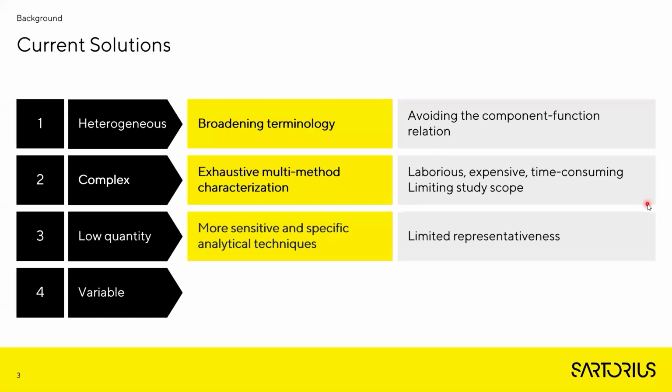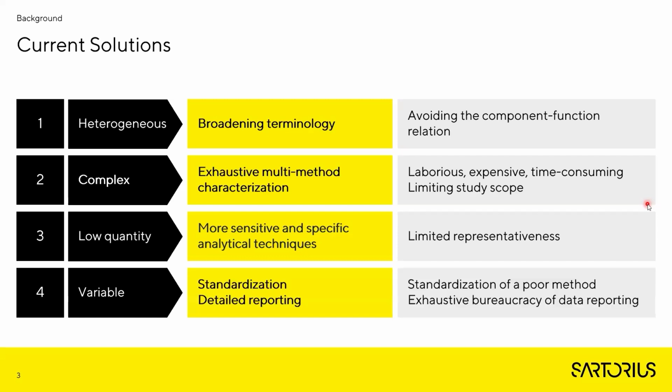Even single particle analysis is possible. However, all this sensitivity has some drawbacks. So we often lack representativity. And again, dealing with many different samples with various sources, we need methods that can be applied on several different samples.